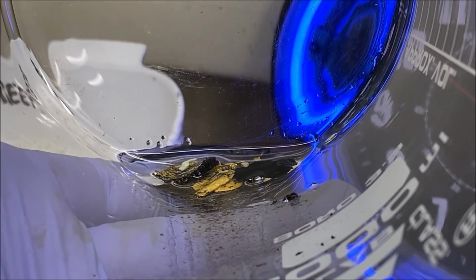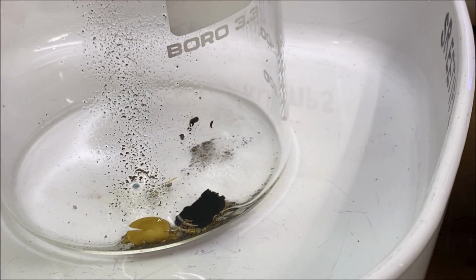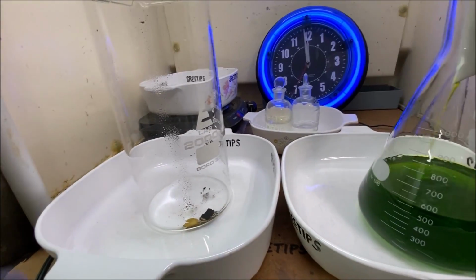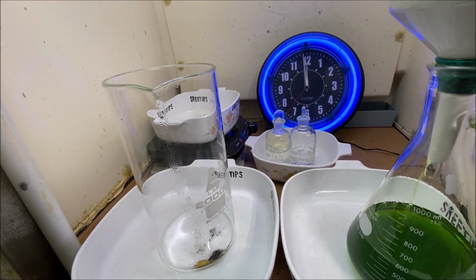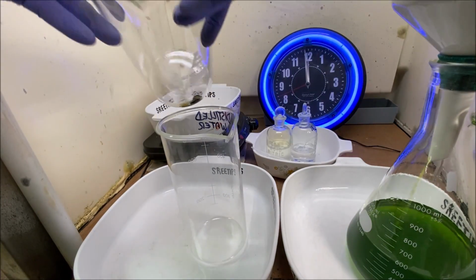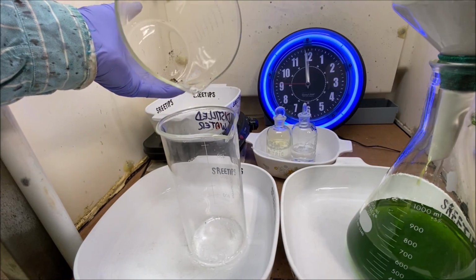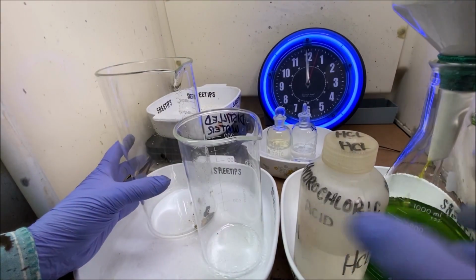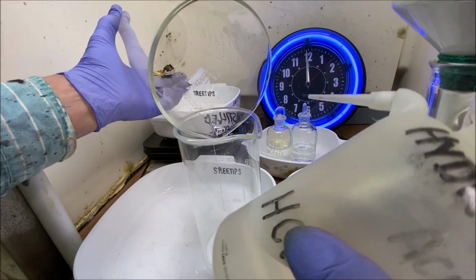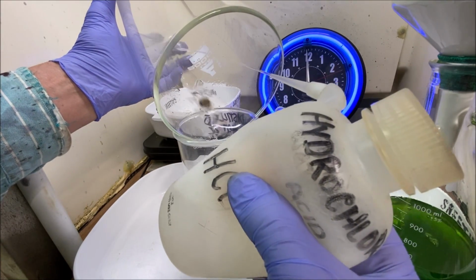There's a little bit of gold left down on the bottom of the beaker. Here's what's left in the bottom of the beaker. It is some gold material. So I think what we'll do here is just rinse this material down into a smaller beaker. Now let's use some hydrochloric acid for this. Rinse those pieces down into this beaker with some hydrochloric acid.